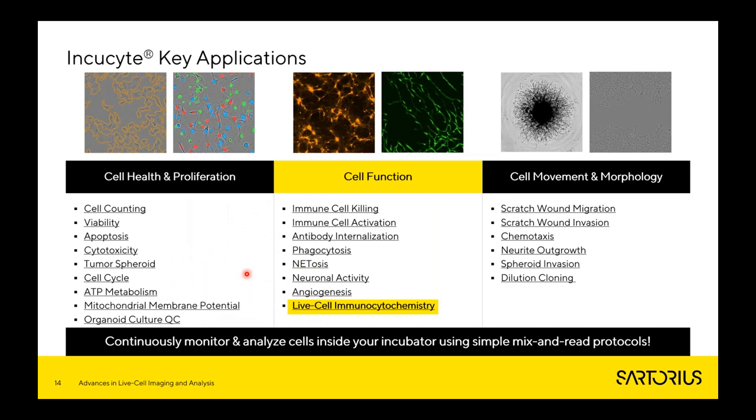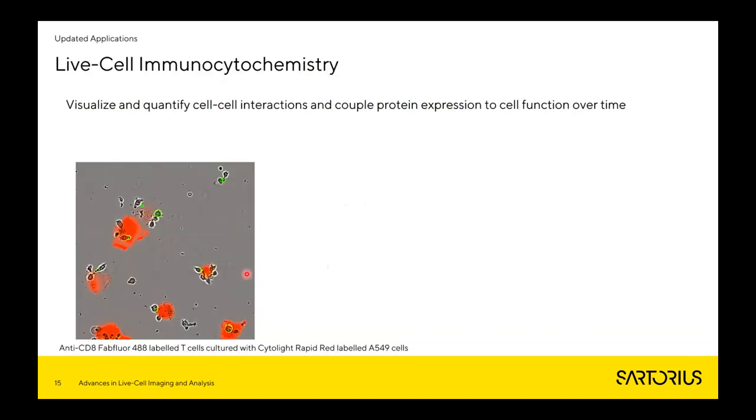So I'm now going to talk about a live cell immunocytochemistry application. And I mention this because in some later slides, I'll talk about labeling of cells. So with this assay here, we're looking at cell surface marker expression over time, or subpopulation determination. And for this, we utilize an IgG Fc portion binding green dye. So this is really designed for monoclonal antibodies.